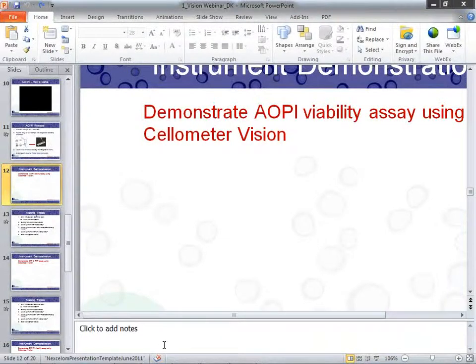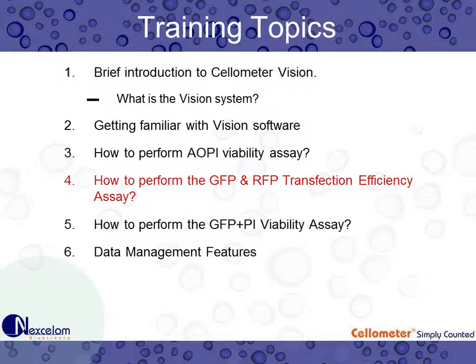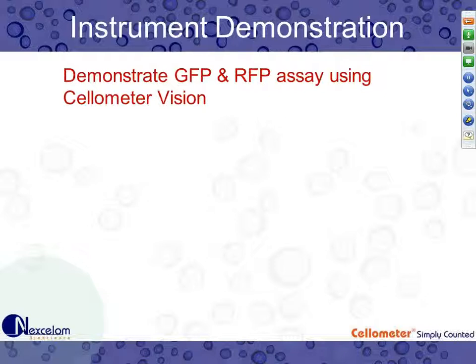So let's go back to the presentation. And so this is how we have just performed a live AOPI viability assay. And now I will show you a little bit about the GFP RFP transfection efficiency assay and how that works.